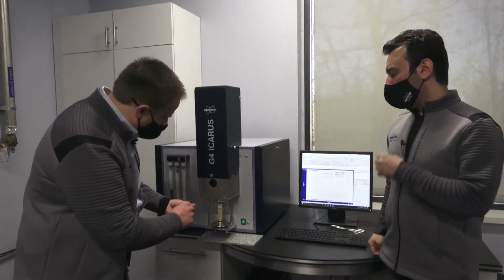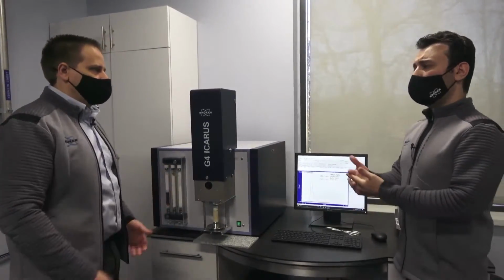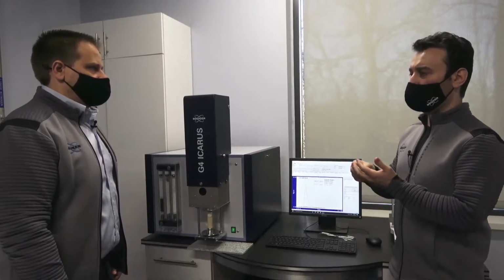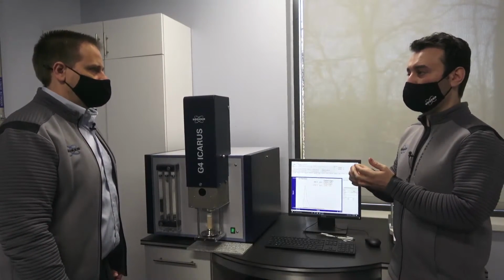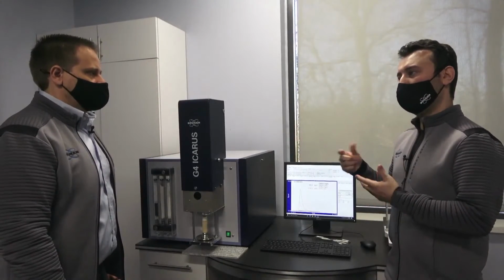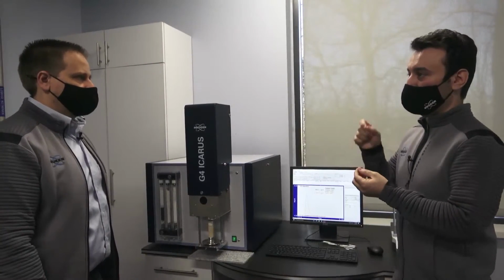Do I have to grind it? Do I use machining? If it's in powder form, you can directly put it in the crucible, no problem. Or if it's some small chips or drillings, or small pieces, small pins, you can also use it. But if it's a big chunk, then you would probably have to drill it to get some sample out of it.